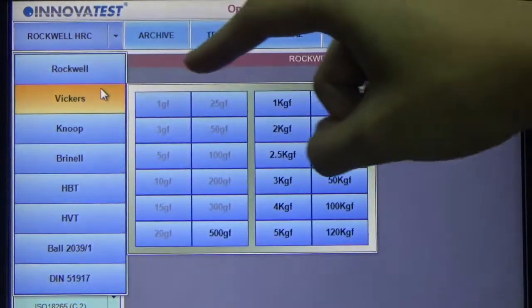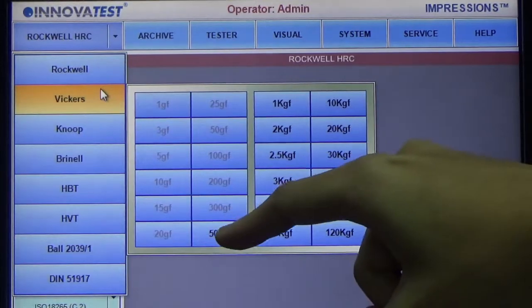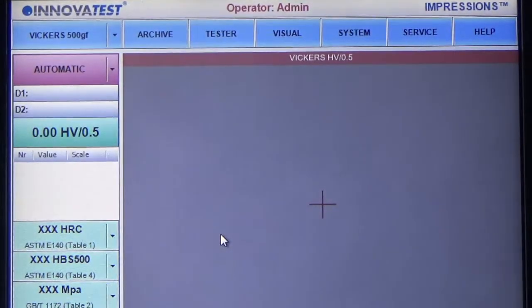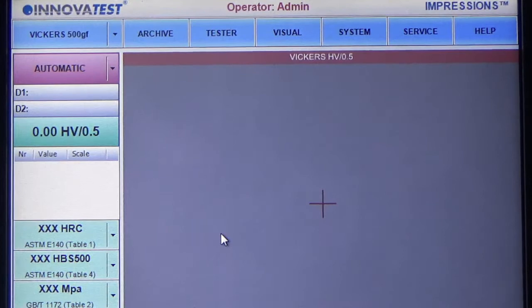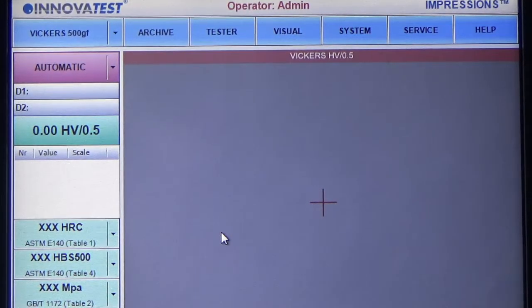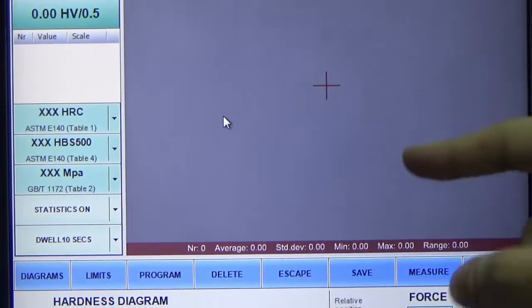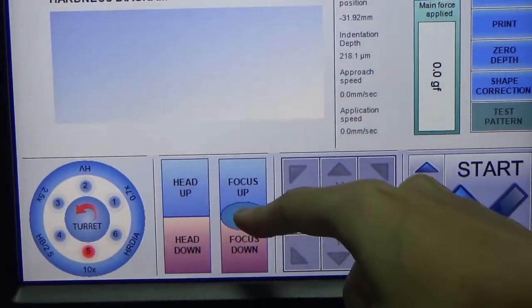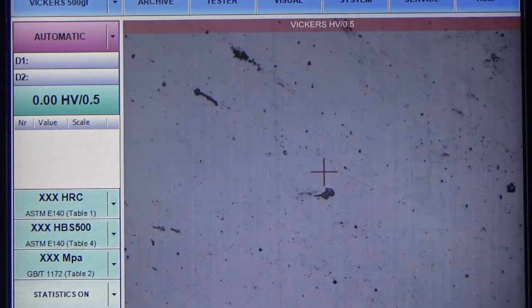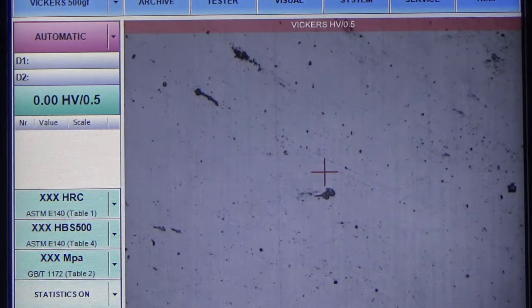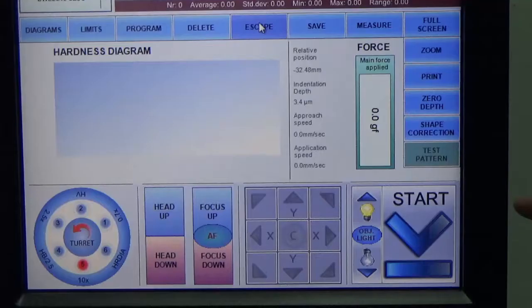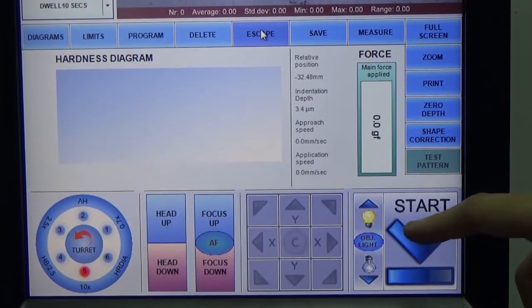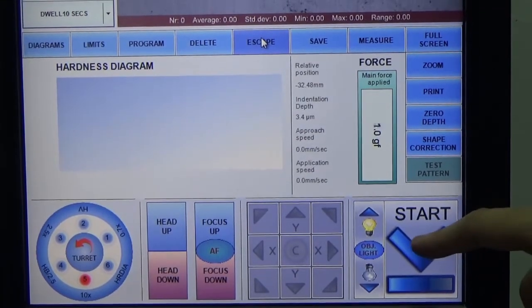In the live image, you can see that it is very blurred. So what we have to do is press the autofocus available here to ensure that a clear view of the sample surface is seen. Just press start and the machine will start the process itself.